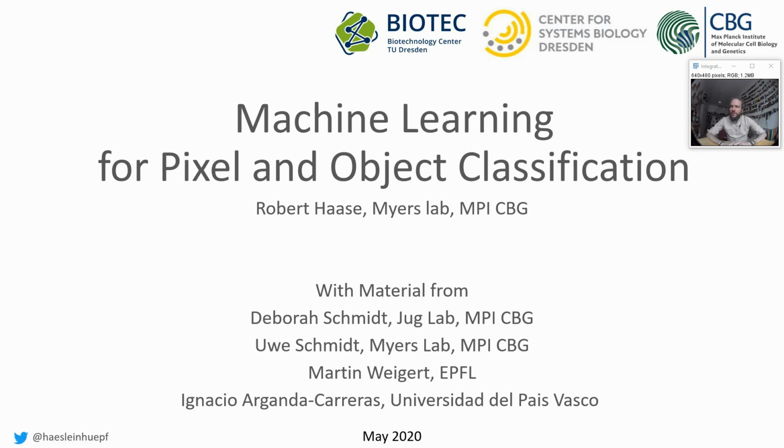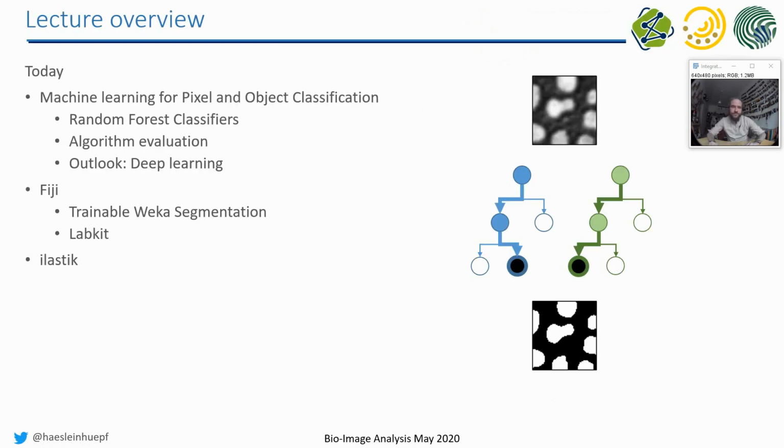Welcome back everyone to a lecture about applied bioimage analysis. This week will be about machine learning and especially about machine learning in the context of pixel and object classification for microscopic images. So just as an overview, I will give a very broad introduction to machine learning in general.